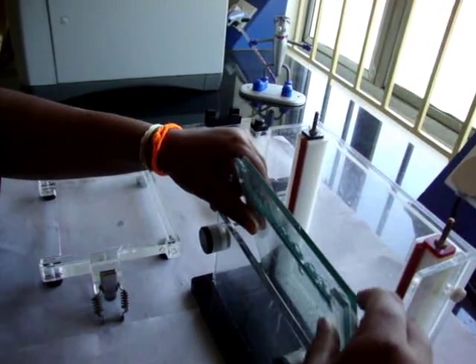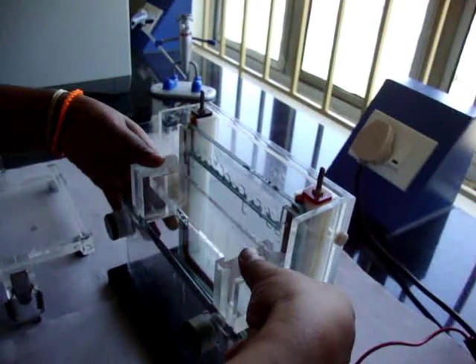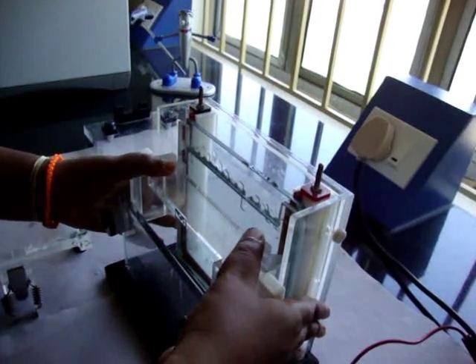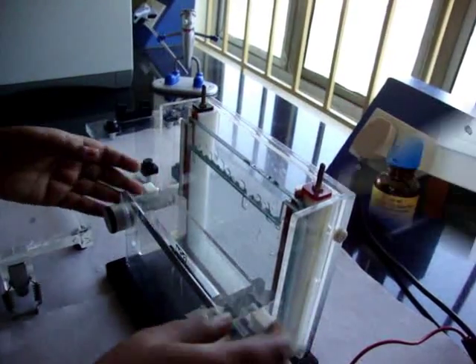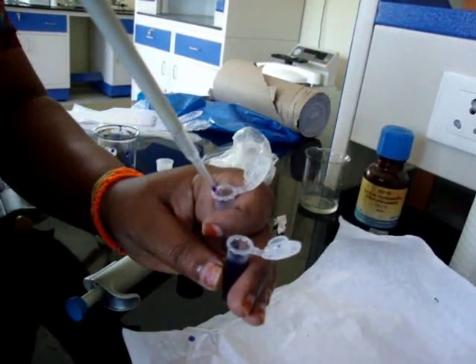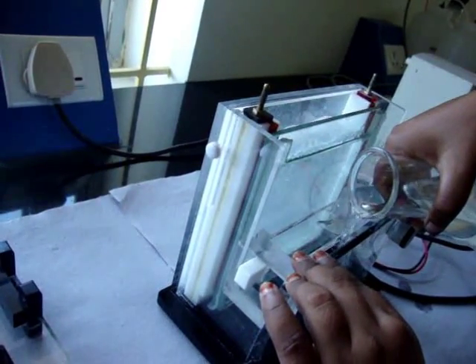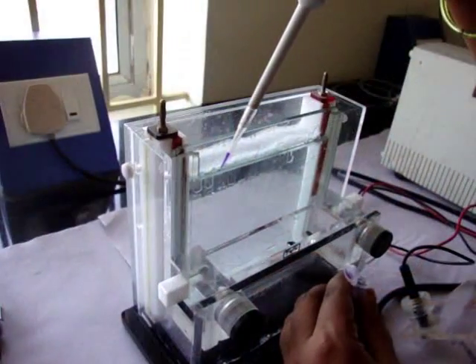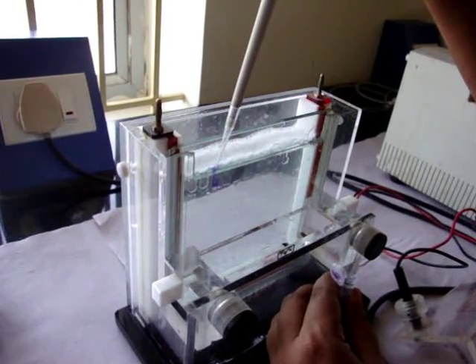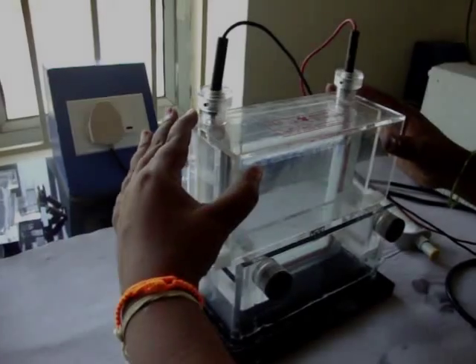The gel assembly is fitted in the electrophoretic apparatus. Depending upon the concentration of samples, the gel loading dye is added. Tank buffer is poured in the upper and lower tanks of the apparatus. 35 microliters of the sample of each genotype is poured directly into the wells. Then electrophoresis is carried out.